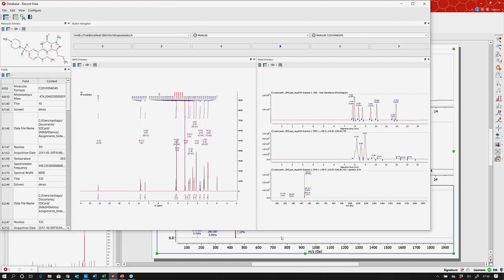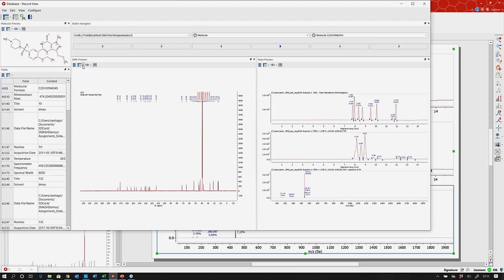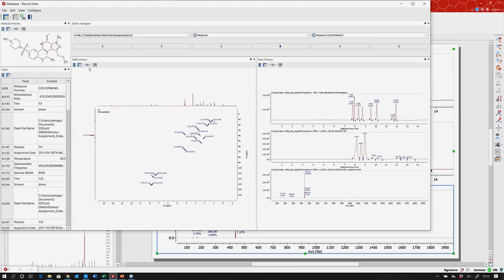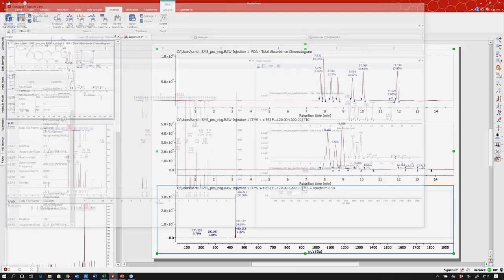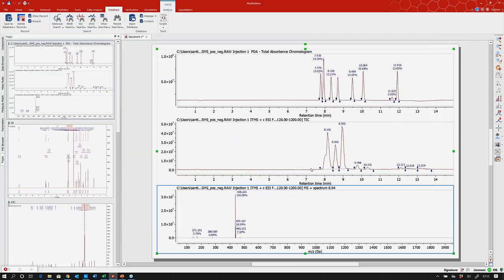Now, without me having to go and acquire NMR data, I could take a look and say, okay, I see that somebody already ran this. They saw this isotopic cluster. They got some NMR. So as we did before, guys, here you could review the different NMR spectra. So I have a full characterization, and I also have a structure, by the way. Great. So maybe what I'll do is run a proton, and if my proton also matches this, I probably have answered my question of what I have in my LCMS.